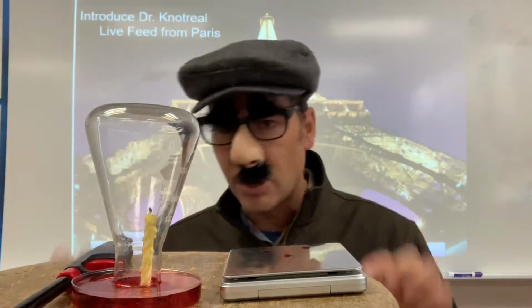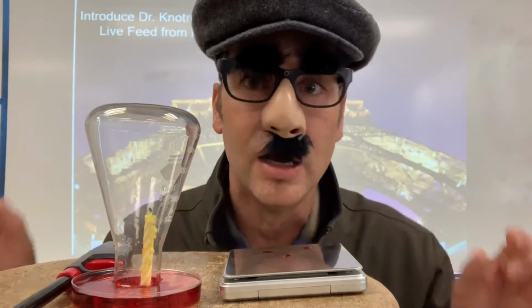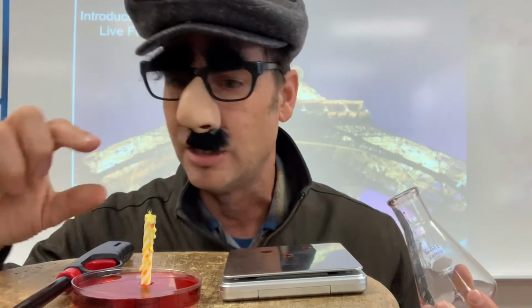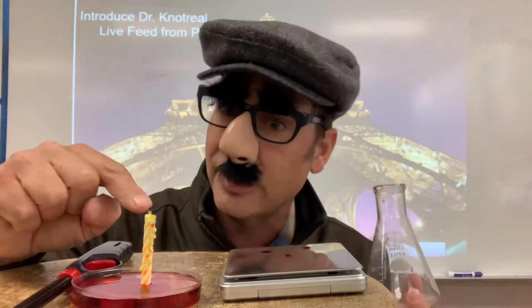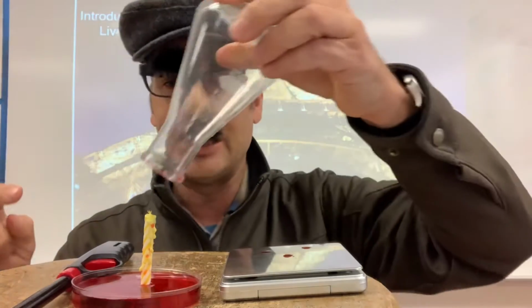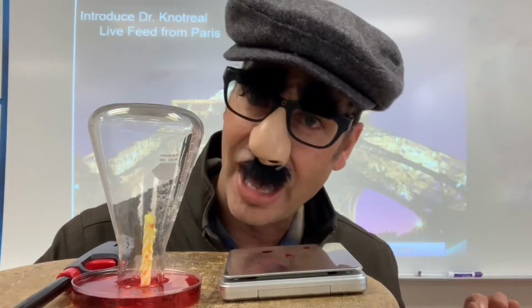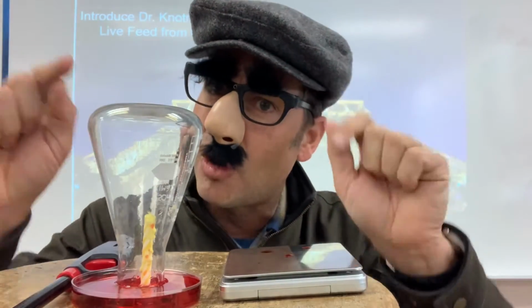Don't forget, you can also measure with a ruler for things like the height of this, the diameter across here, the height of the candle, the height of the wick. So feel free. The more you have, the better, because this lab is to practice quantitative observations. Thank you very much. I will be back in a moment to show you how to light the candle.